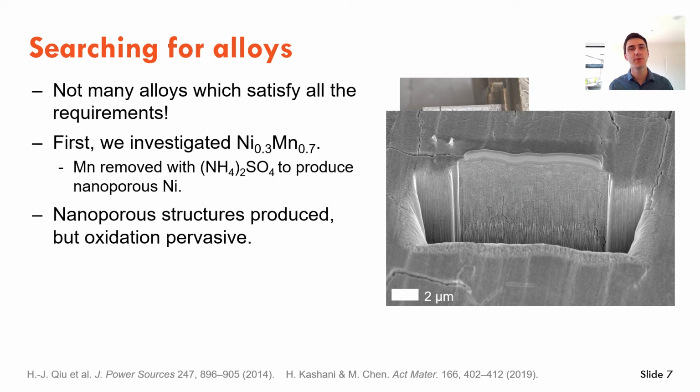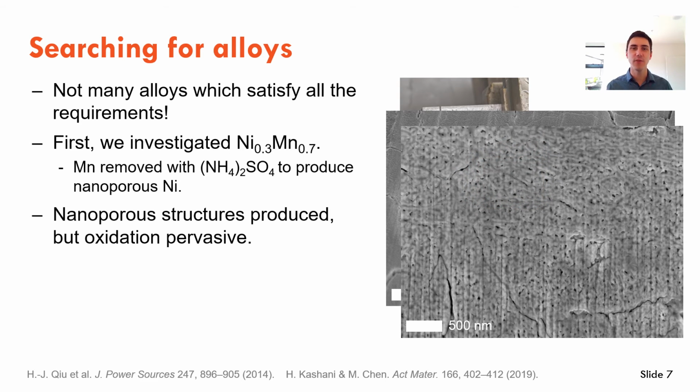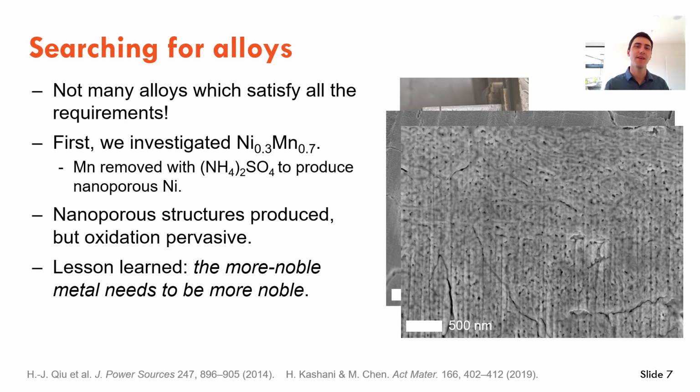Overall, it worked, but oxidation was a major problem at every processing step: sectioning, electropolishing, and dealloying. The image shows a FIB trench cut showing nanoporous nickel, but with pervasive oxides inside the pores. The lesson learned from this is that the more noble metal needs to be more noble.